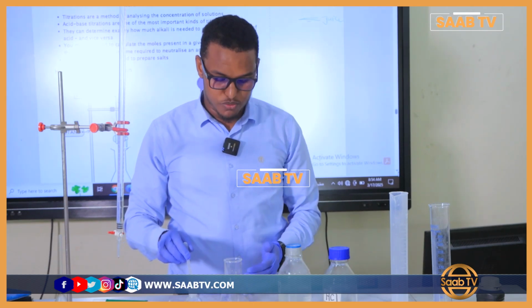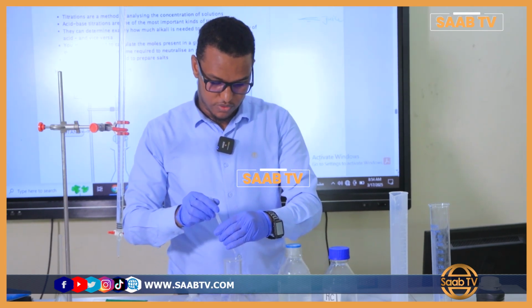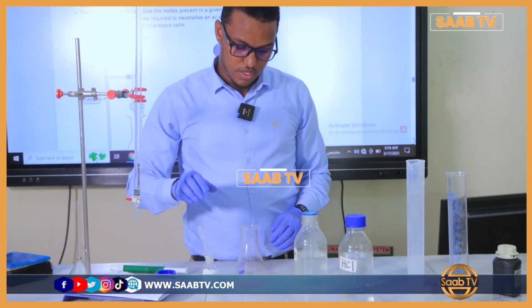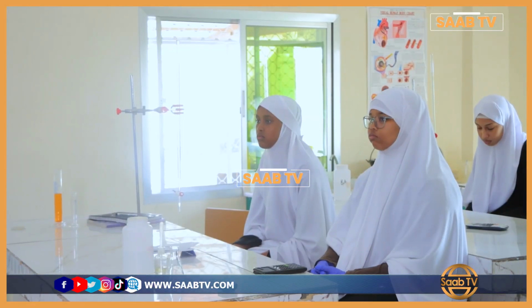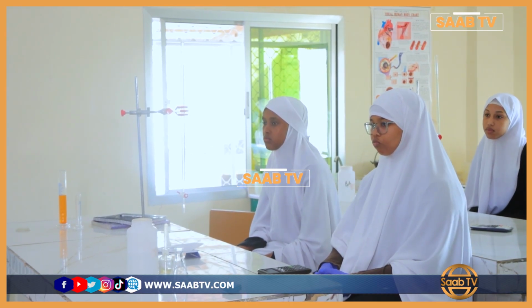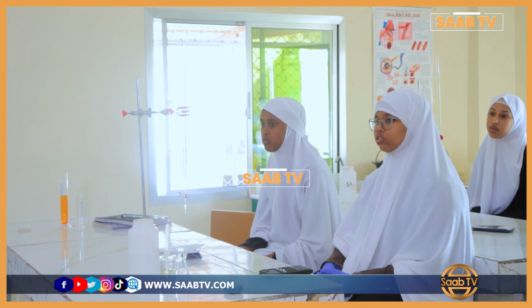Let me observe how the color is changing. 1, 2, 3. Okay, and then let's mix it. How about the colors? Very beautiful. This one is pinky. It shows us this is the alkaline because we know the phenolphthalein turns pink in alkaline solutions.